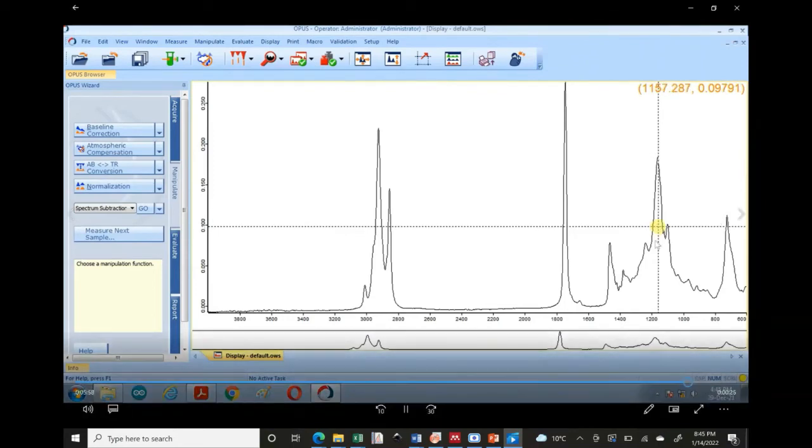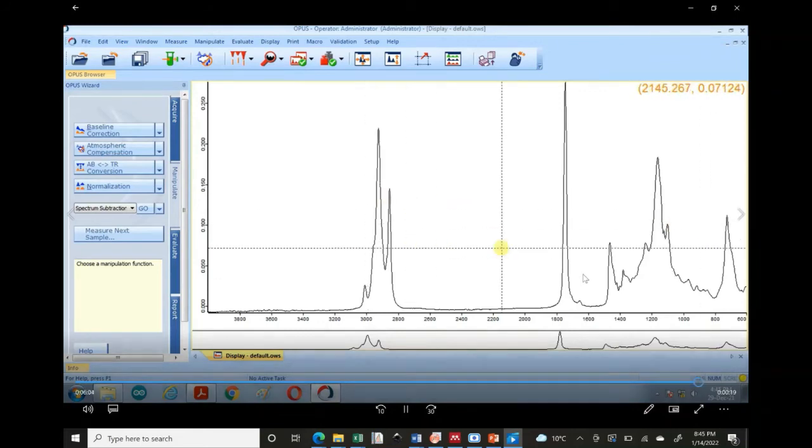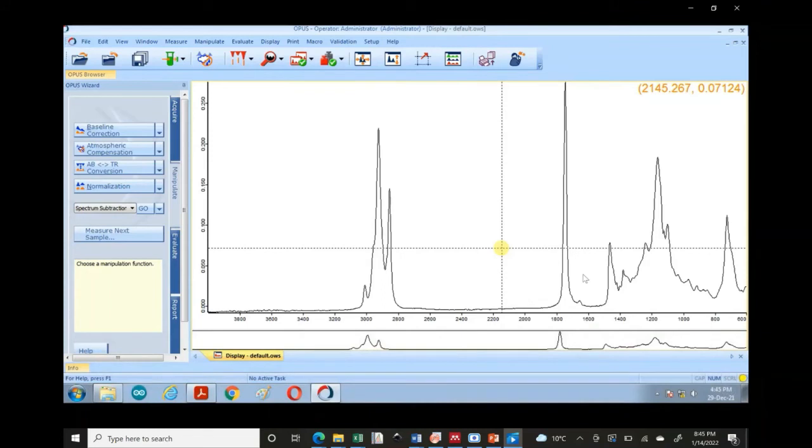As I said, each and every peak which we get from either the absorbance or the transmittance spectrum is represented for some kind of vibrational energy, either the bending or the stretching, as we have already discussed in our tutorial video.